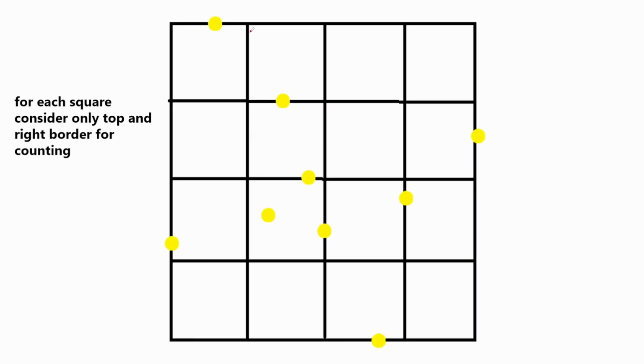You can see over here I am starting to count my cells in one of the corner squares of the hemocytometer. As I move along, I'm only going to count cells that touch the top as well as the right boundary. Okay, so when I come into this box, I see one cell sitting over here, so I will write I have one cell in this small box.